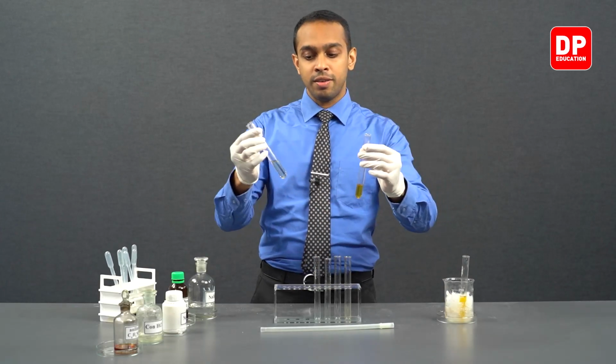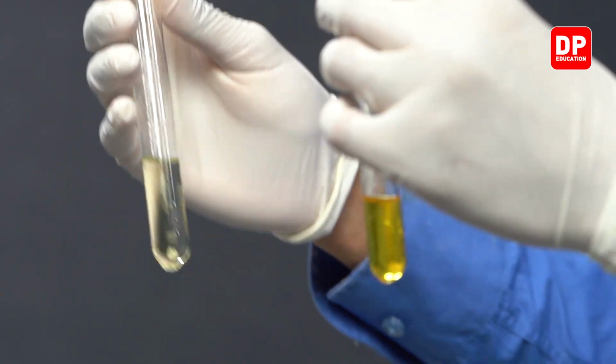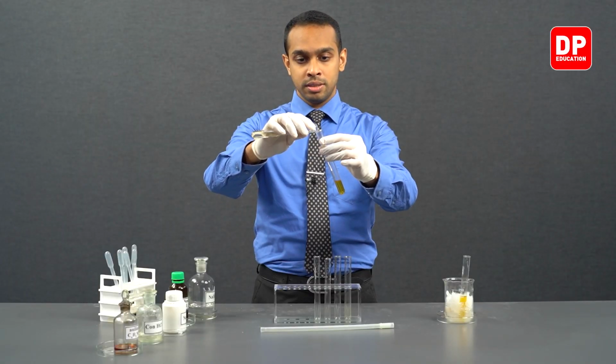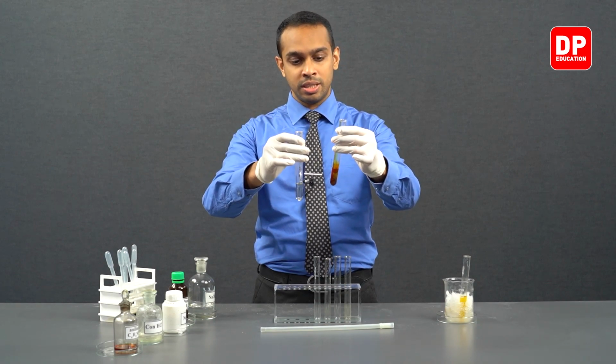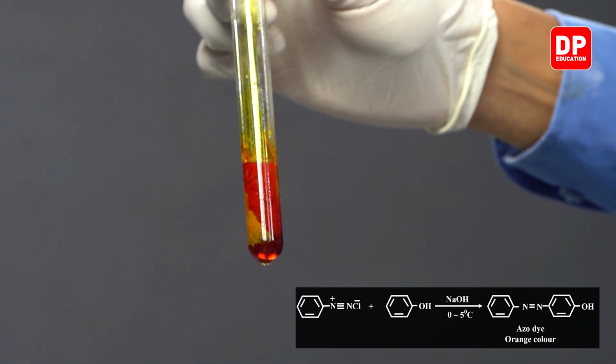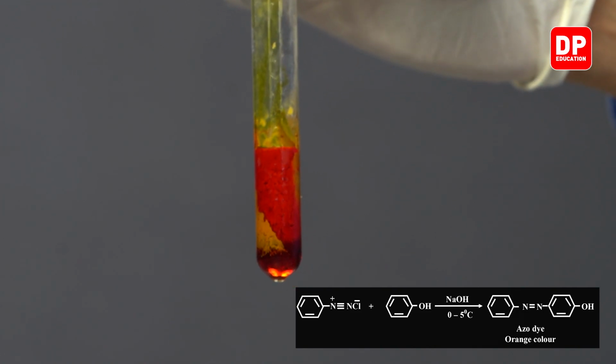We have our phenol mixed with 10% sodium hydroxide solution over here. Now we are going to add phenol mixed with 10% sodium hydroxide into our benzene diazonium chloride salt.